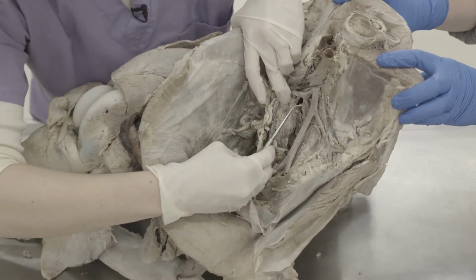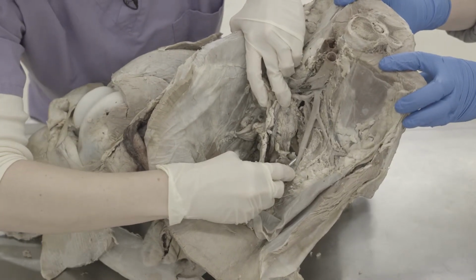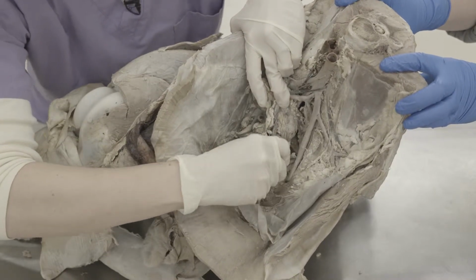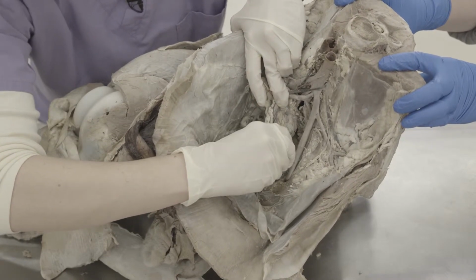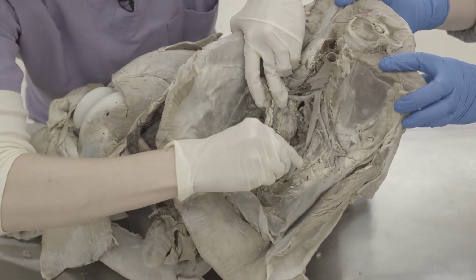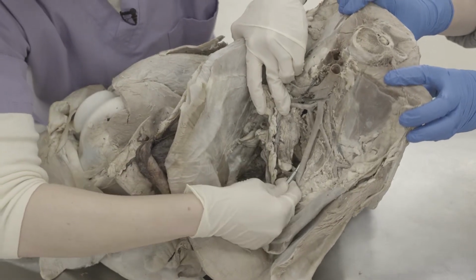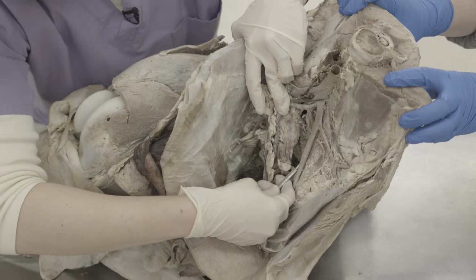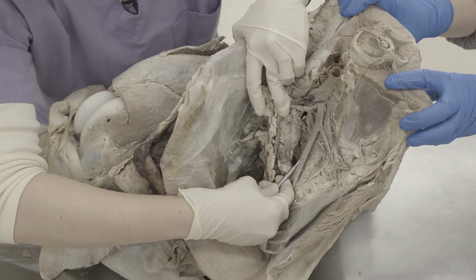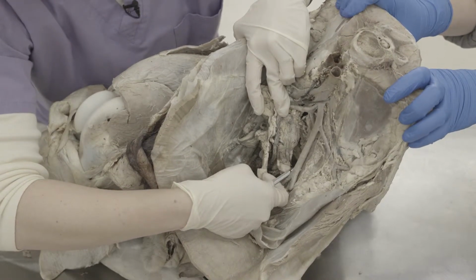Then you're going to follow the internal iliac, and it's a little bit different in the branching pattern than it is in the equine. And so you're going to follow it inside, and then you're going to continue outside of the pelvis where we just took that half of the pelvis off so that you can see it a little bit easier. I'm not sure that you'll be able to see where this is coming off, but I'll try and elevate it with the probe. So here you would have what's called an iliolumbar, and it's just a small branch coming off. And then you would also have your cranial gluteal coming off of the internal iliac here as well.